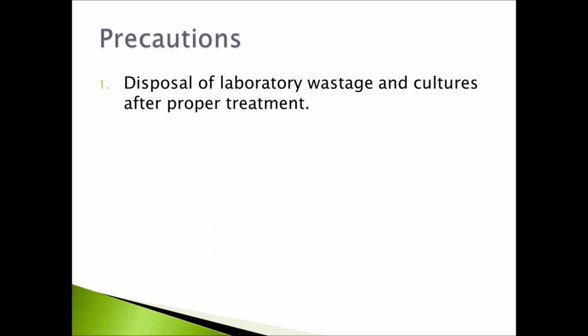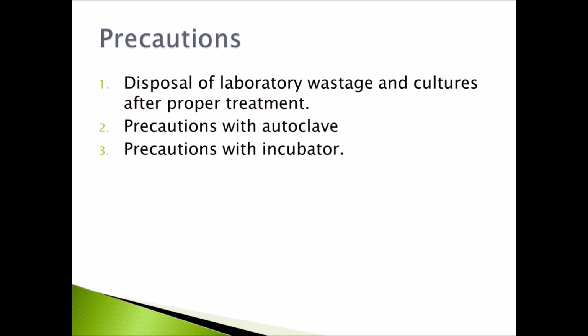Number one, disposal of laboratory wastage and cultures after proper treatment. Number two, precautions with the autoclave. Number three, precautions with the incubator. Number four, precautions with the pH meter. Now, number one, disposal of laboratory wastage and cultures after proper treatment.